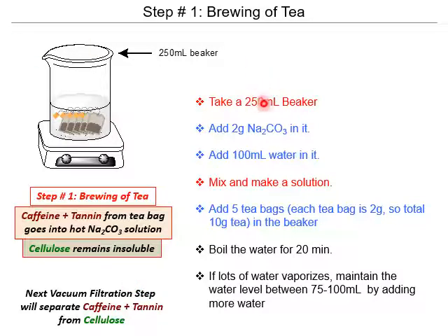So you take a 250 milliliter beaker. When you choose a beaker, you always try to take into account the volume that you're going to put in it. So if you're going to put 100 milliliters of water and you're going to boil it, it's a good idea to have 250 mLs. Water is sort of not too violent, but it's sort of violent, right? If you fill a pot up to the brim with boiling water, it will spill out and it'll make a mess, right? So just a tip when choosing beakers.